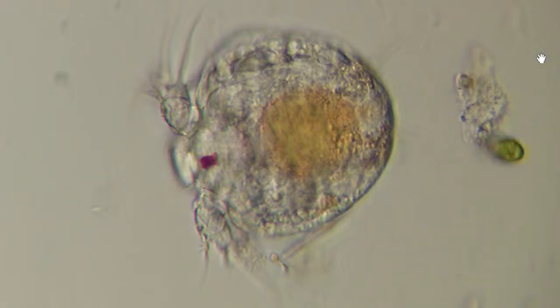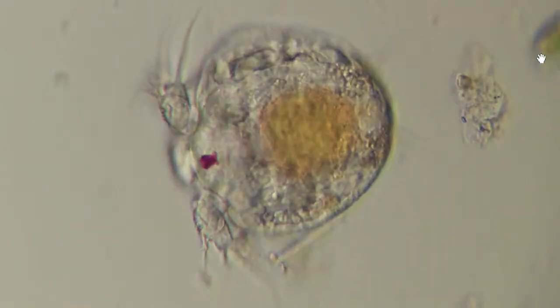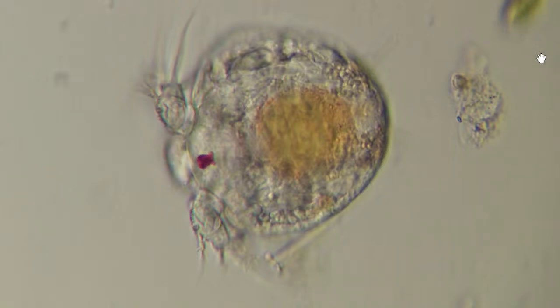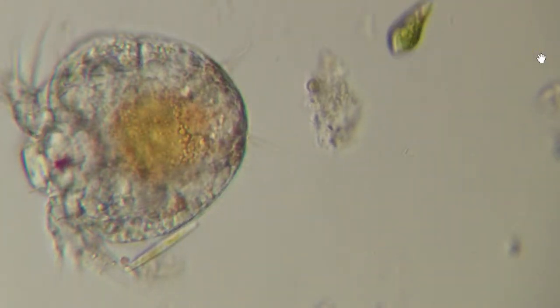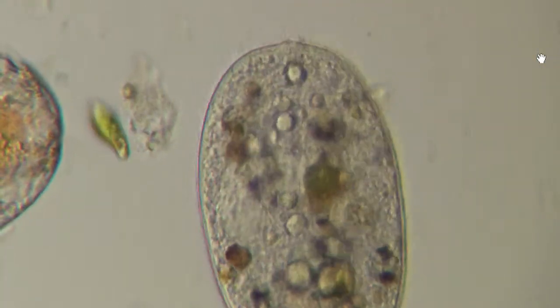You see it much bigger on my other streams where it's like a micro shrimp, basically. It's in the same group as the crustaceans. And it's got the eye spot, it's got these little limbs, but the larval stage looks like this. I think it's called a nauplius larva. I have to double check that. And there's a cool undulating. Look at that guy doing his little dance there. And he's back. Yay. I'm going to follow this guy for a little bit.